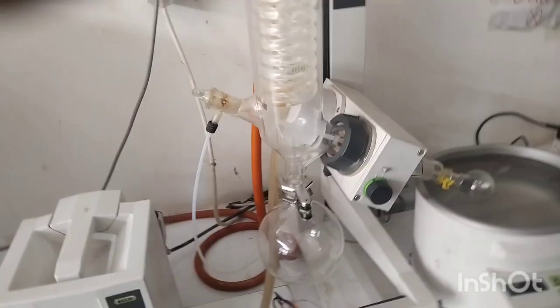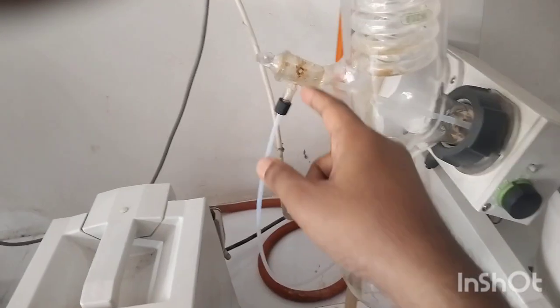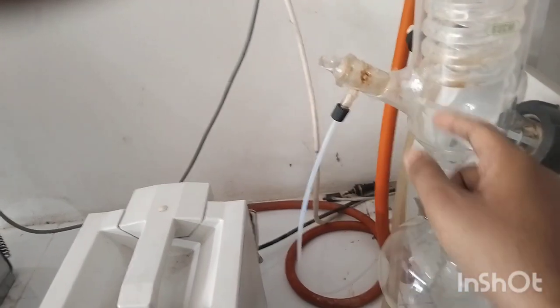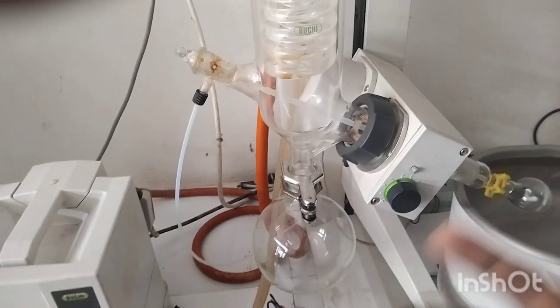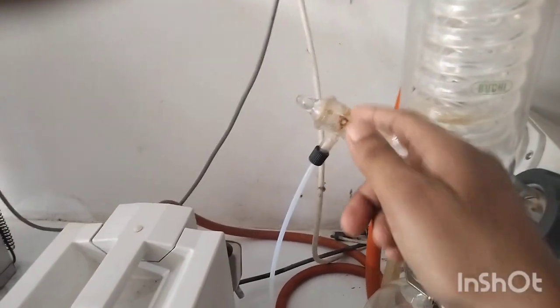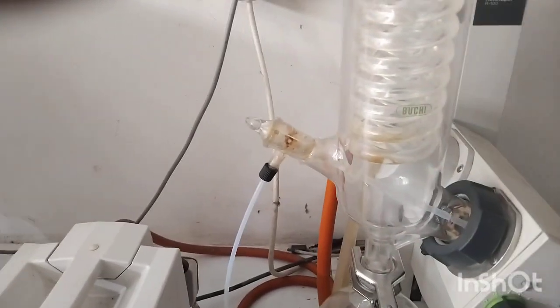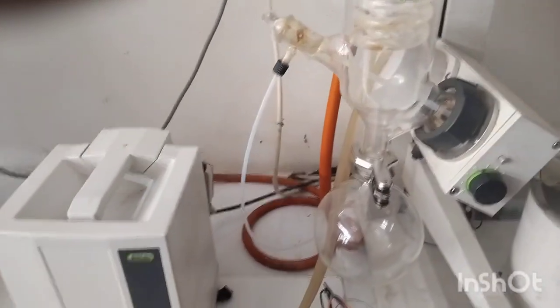When you'd like to use this specific system, you have to be careful about this specific glass rod. You have to use grease or a glycerin type compound to keep this specific portion very smooth, and you will be able to dry properly, and there will not be any kind of problem. So that's it.